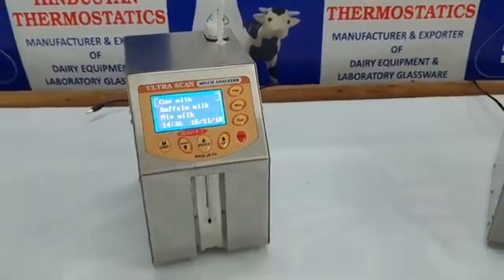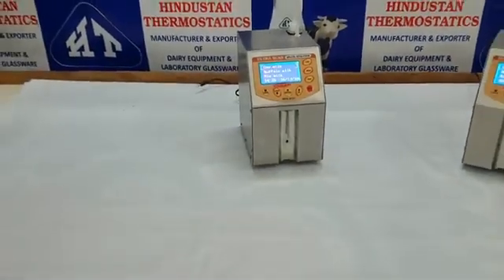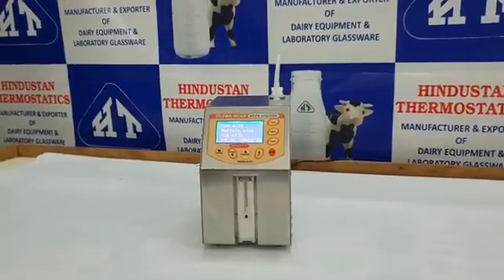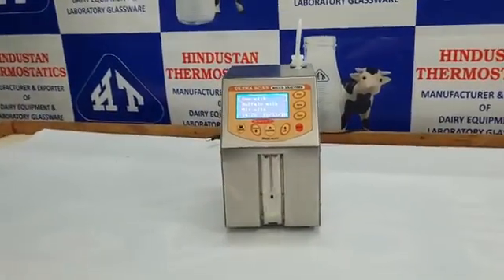The question arises: why is Ultrascan better than other analyzers? The most straightforward answer is affordable price combined with the best features and quality.